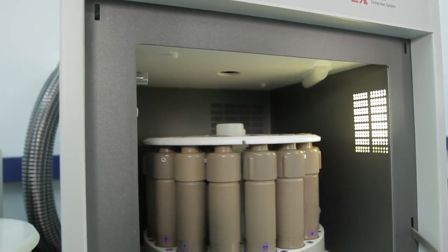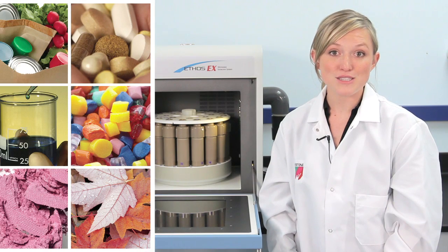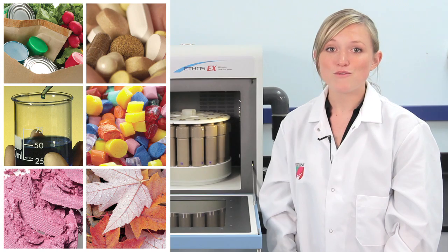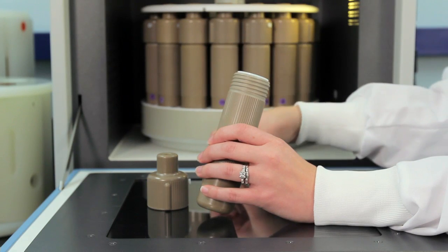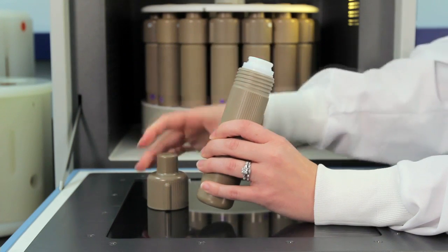To perform extractions on a wide range of samples ranging from environmental, API pharma, polymers, food, and other materials, simply weigh the sample into the vessel, add the solvent and a stir bar, add the cap, and just tighten by hand.